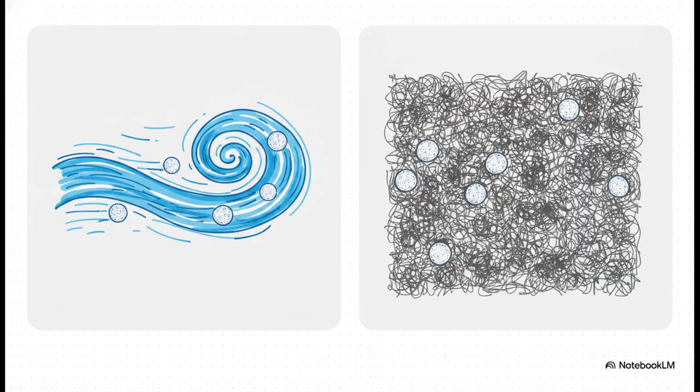This is the fixed material, usually a solid or a liquid layer, that literally slows down the components of the sample. So the molecules that strongly adhere to the stationary phase, well, they get swept along way less rapidly than the ones that don't. And it's exactly this difference in stickiness that separates the molecules out in space or time.